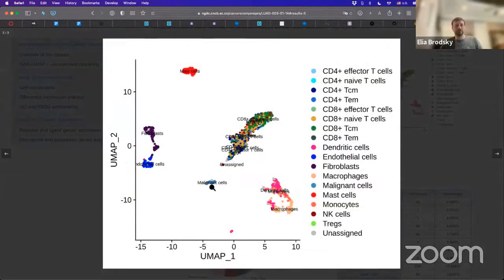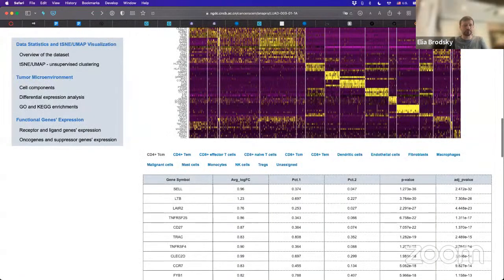So they are very different. And that is because if I could look at the tissue and say, here's the group of malignant cells, they're not going to be grouped together. They could be spread out, right? But I can now identify them. And that is very important. Okay, so this is an example, again, we have for cancer. And you can take a look at other examples as well.